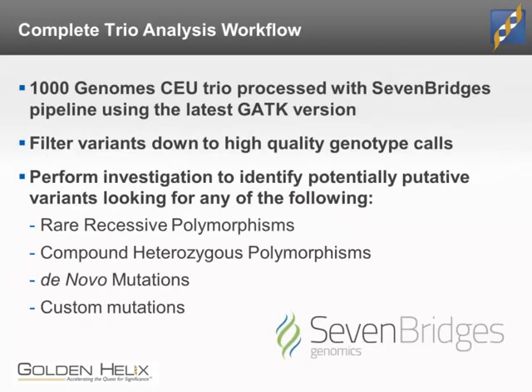The complete trio analysis workflow uses public data obtained from the 1000 Genomes project. The samples chosen were a trio of Ceph samples, and the BAM files were reprocessed using 7Bridge's secondary analysis pipeline in the latest GATK version. The VCF files were imported into SVS, and then the genotype calls within SVS were filtered down to remove variants with low genotype quality and read depth, leaving only high-quality variant calls.